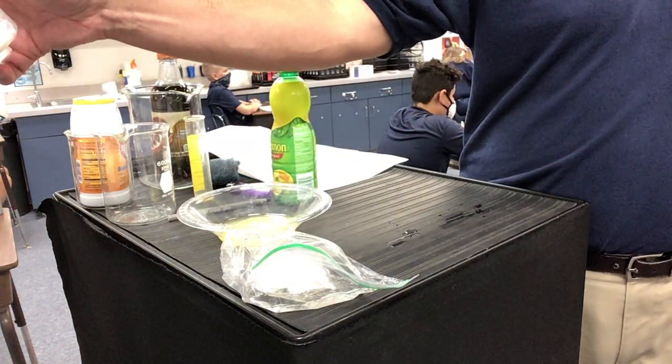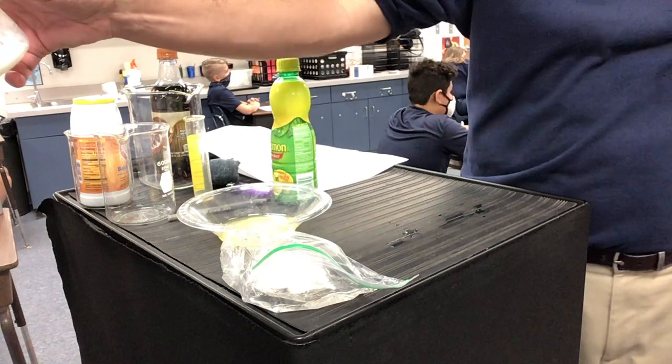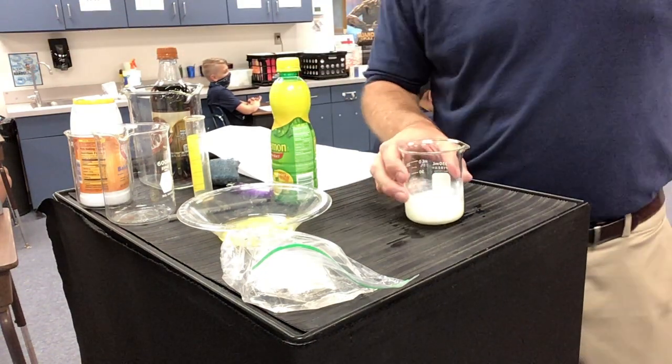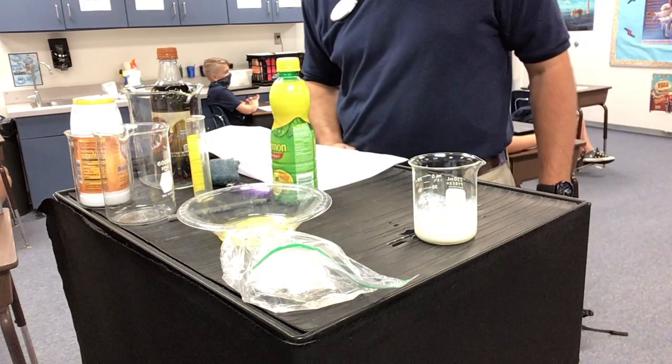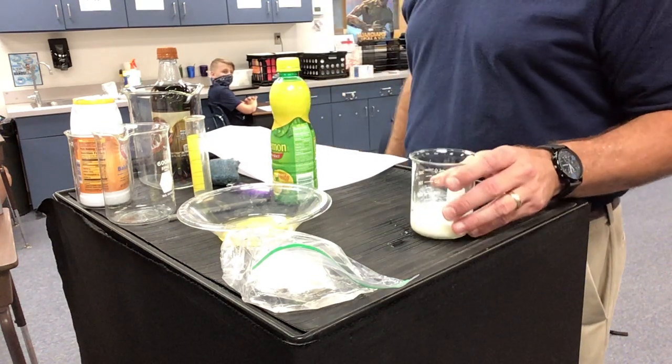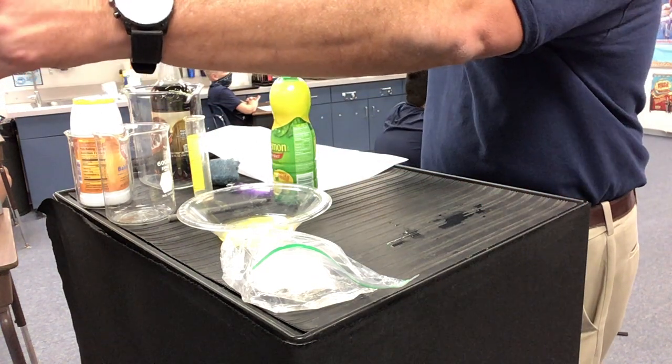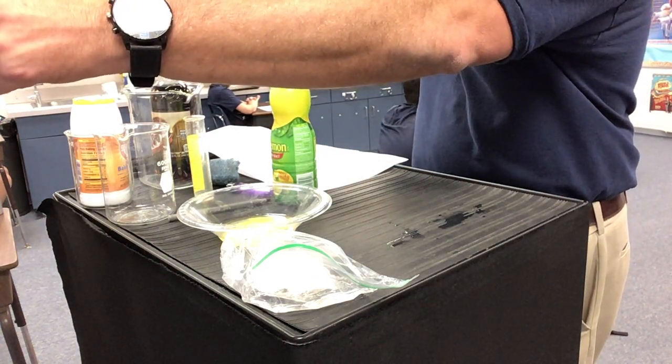Is that changing color? Bubbles, is it making bubbles? There's a couple bubbles in there right now, but is it actually making more?